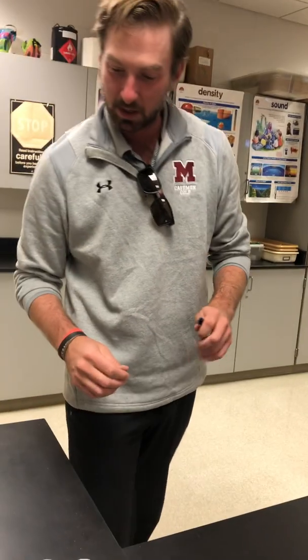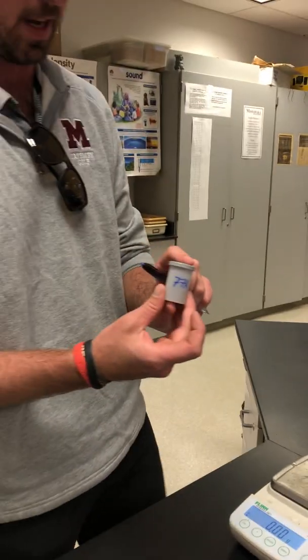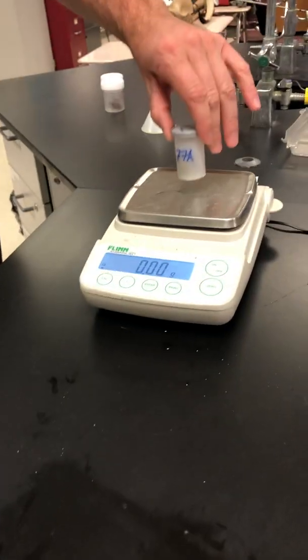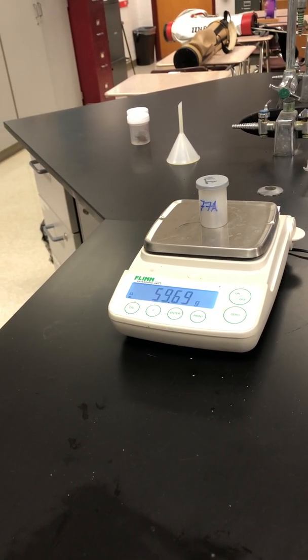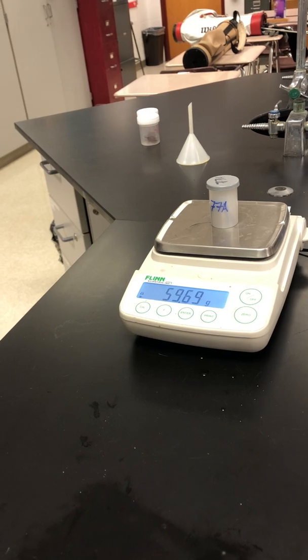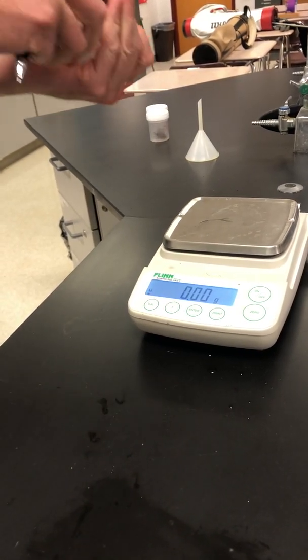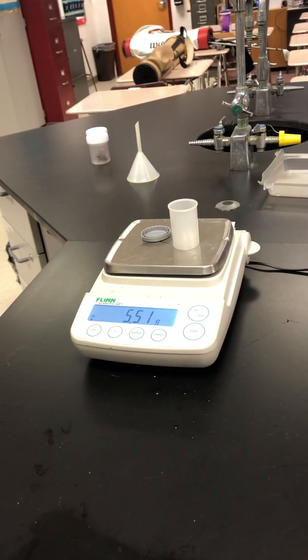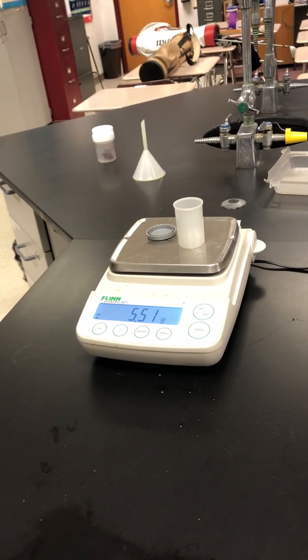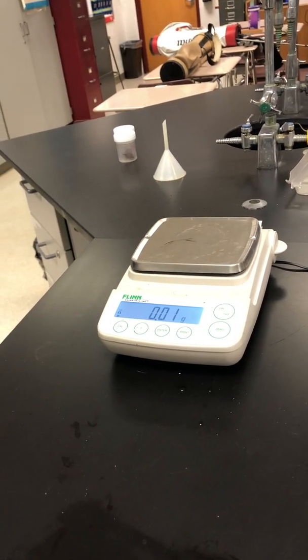Last names between the letters S and V, you have 77A. The container with the pennies has a mass of 59.69 grams, and without the pennies, it has a mass of 5.51 grams.